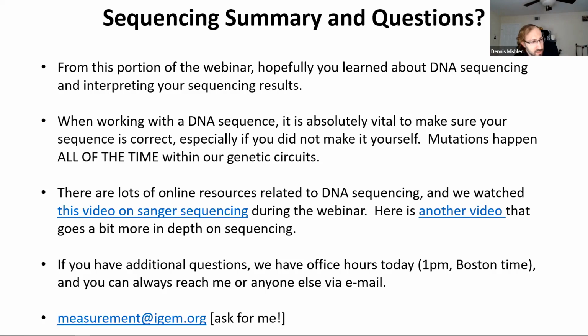If we perform Sanger sequencing multiple times, will that help? Yes. Generally, if you repeat the sequencing reaction and you get a different result, it tells you there's an error in one of the two sequencing reactions. You can alter where the primer is located to help you a little bit with the resolution. But sometimes if it's in the middle of the sequence, you just resend the exact same sequencing reaction in a new tube, and then that'll clear it up, right?